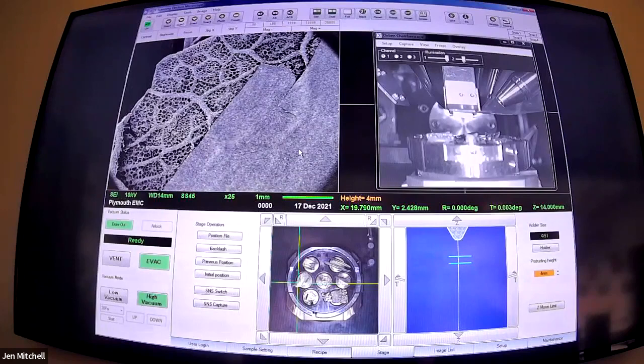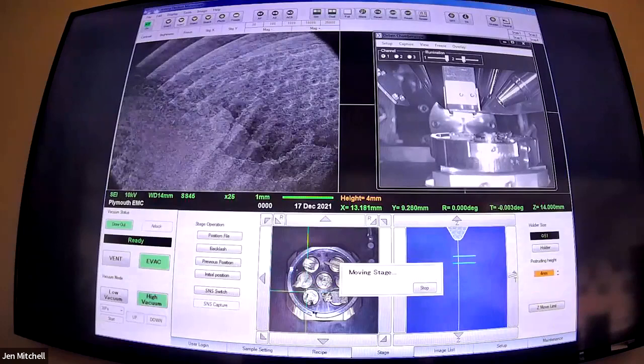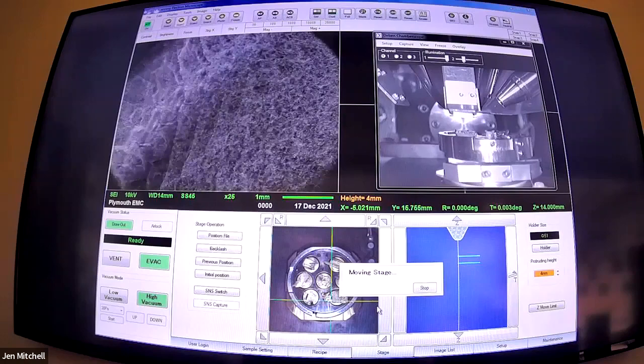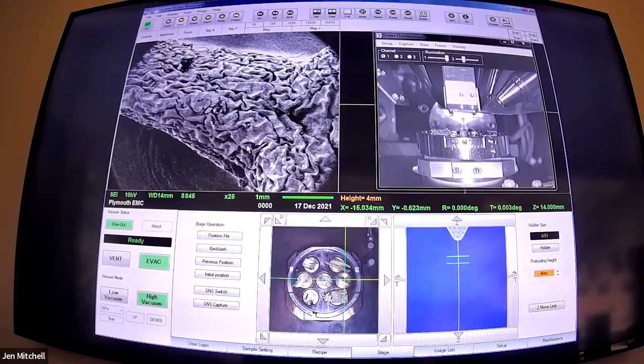Number three - I've got to drive over to it. No surprises here: you can see the stage moving around inside the microscope, which is pretty cool. All these little schematics update as we go, just to try and avoid driving into anything. Another very wrinkly, highly textured sample.